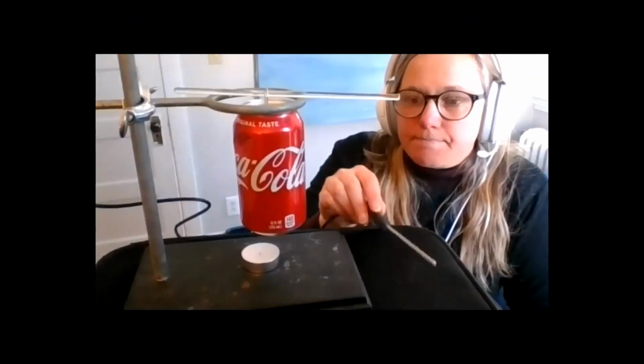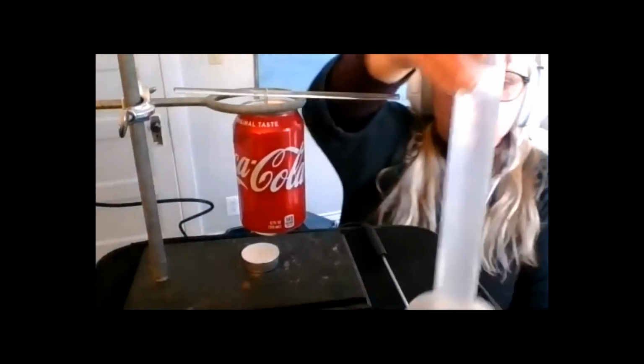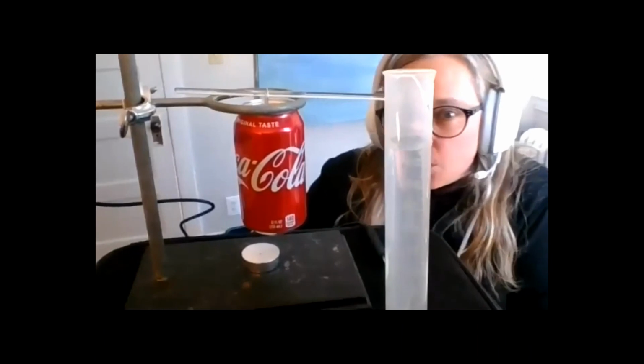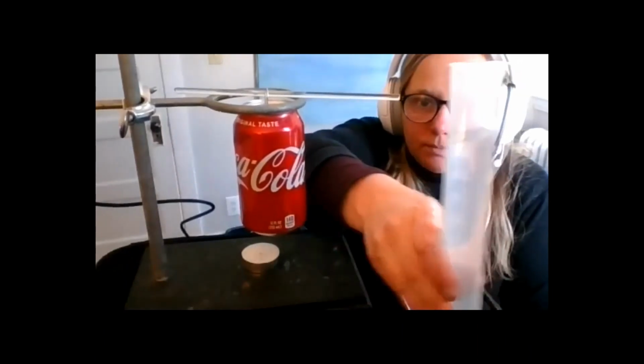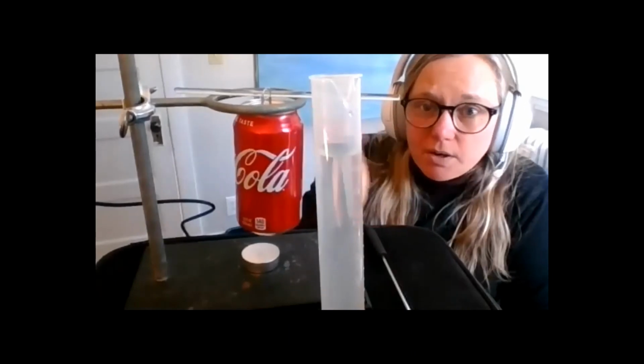The tricky part about this deal is you're going to want to get cold water. So your 100 milliliters of water needs to start out pretty cold. It needs to be at least 10 degrees below room temperature. So figure out some way to make it cool.